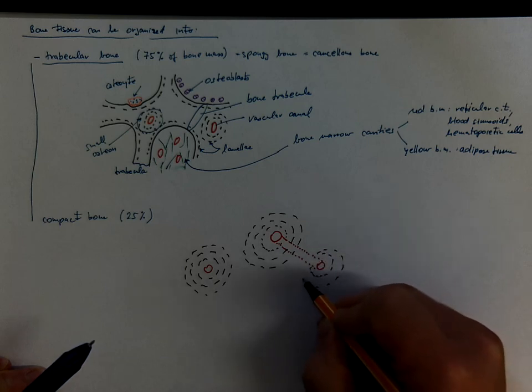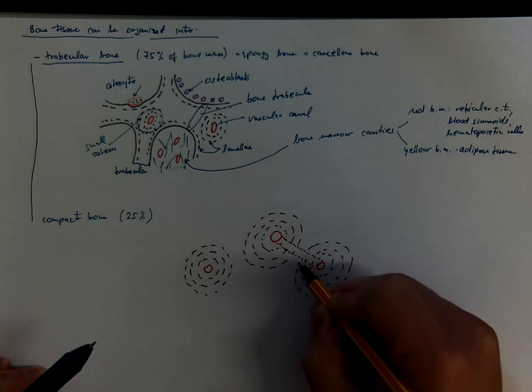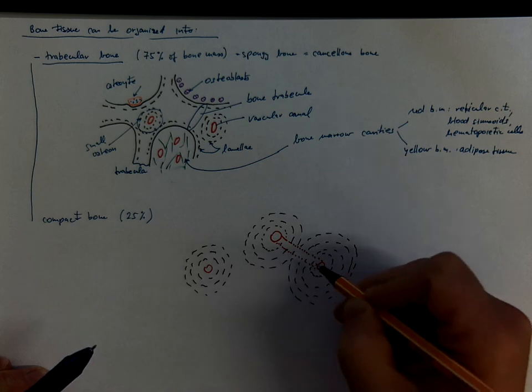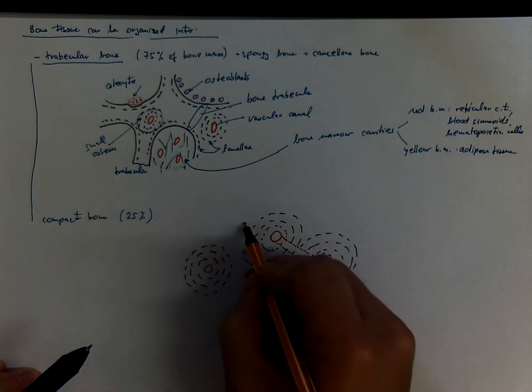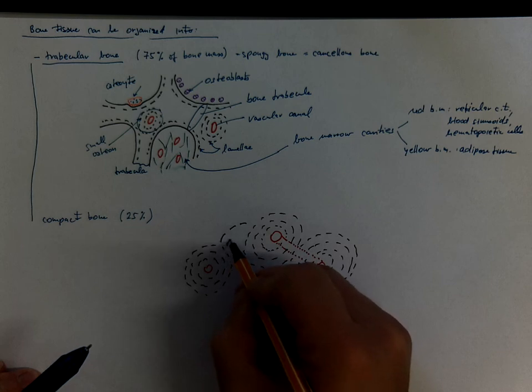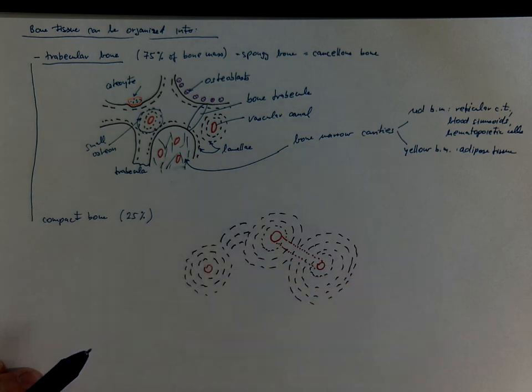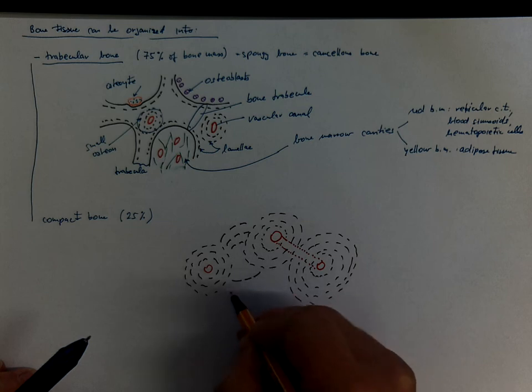The osteons are dynamic structures, so some of these are growing and some of these are being replaced by new osteons. So you can find lamellae not belonging to any currently existing osteon, like remnants of previous generations of osteons.